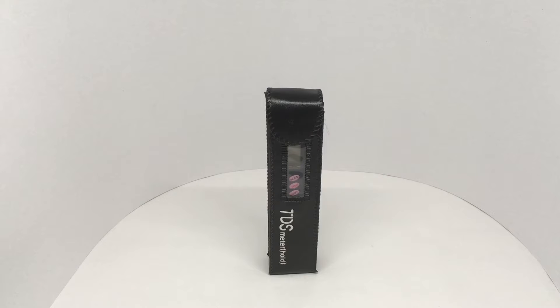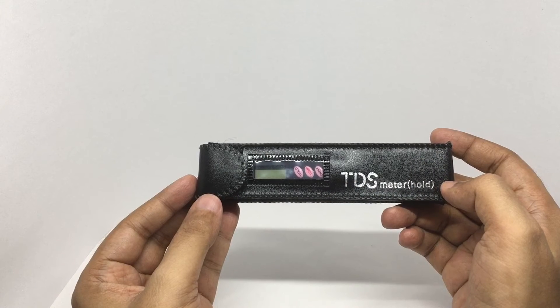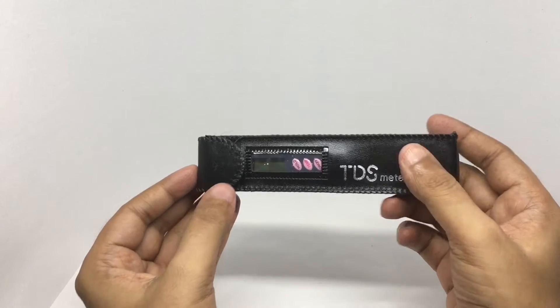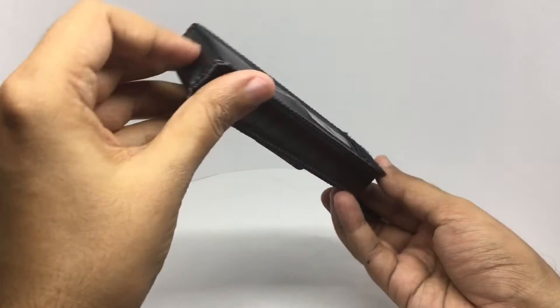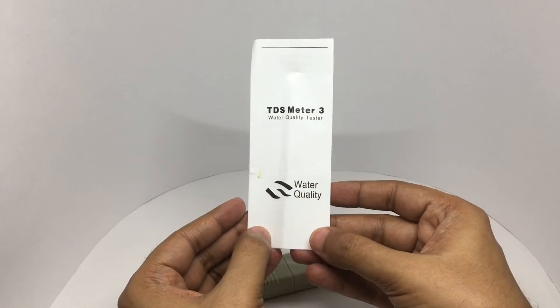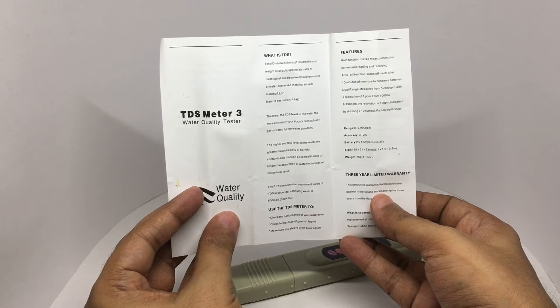Let's take a look at this water tester — this is a TDS water quality tester. This meter costs around 275 rupees or six dollars or so. You get a carrying case with it, a belt clip, and a small booklet. TDS means total dissolved solids: the total weight of solids, mineral salts, or metals that are dissolved in a given volume of water.